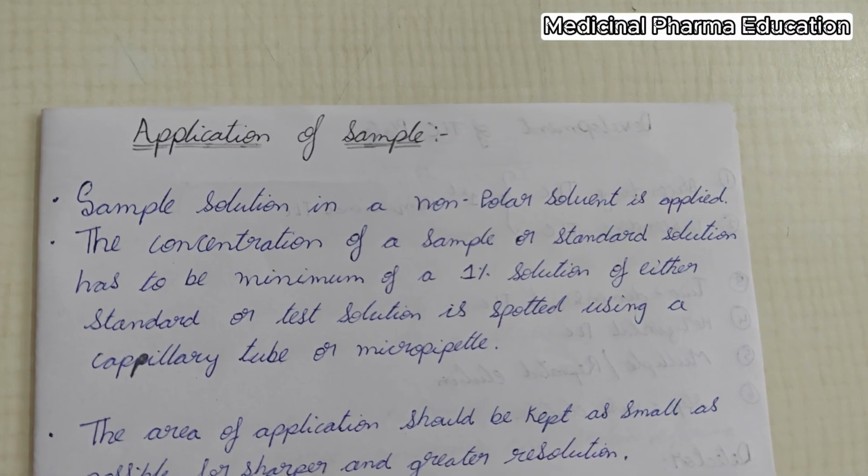Next, we will go with the application of the sample.